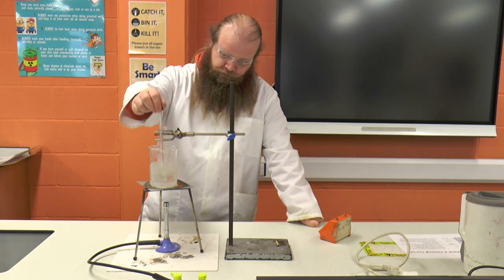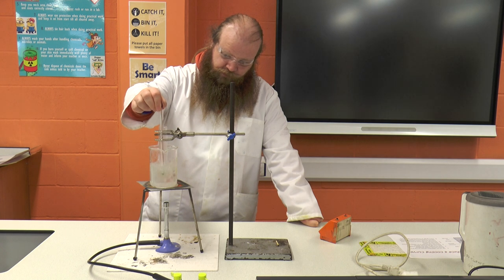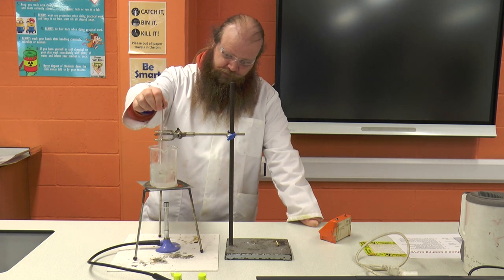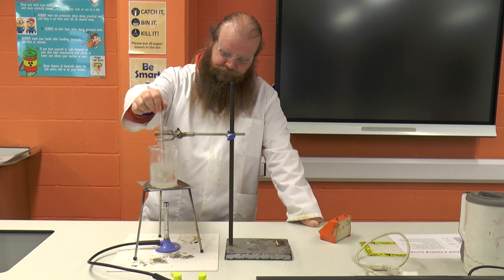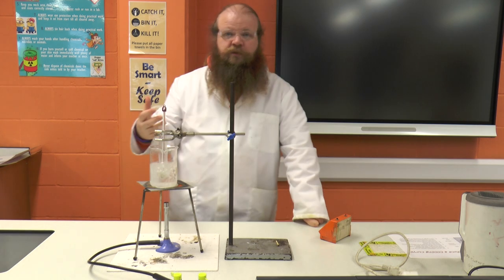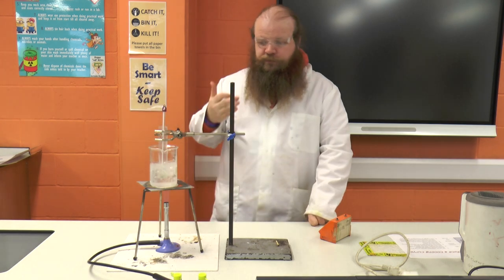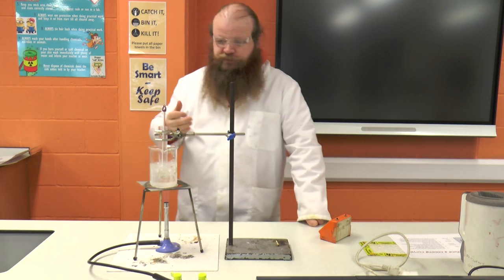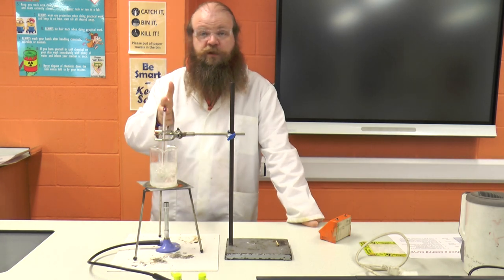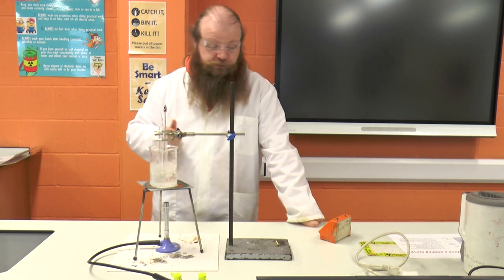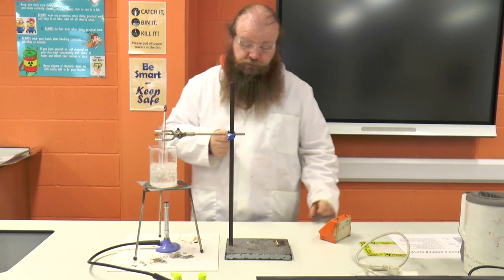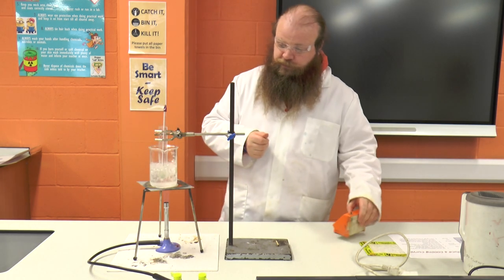We don't want the liquid to overboil — we just want to make sure that it's at a reasonable temperature so that we can quickly melt our stearic acid. While we're doing this, we should be making sure that we're wearing our safety glasses because we are dealing with not only a chemical but also a hot chemical and a hot liquid.